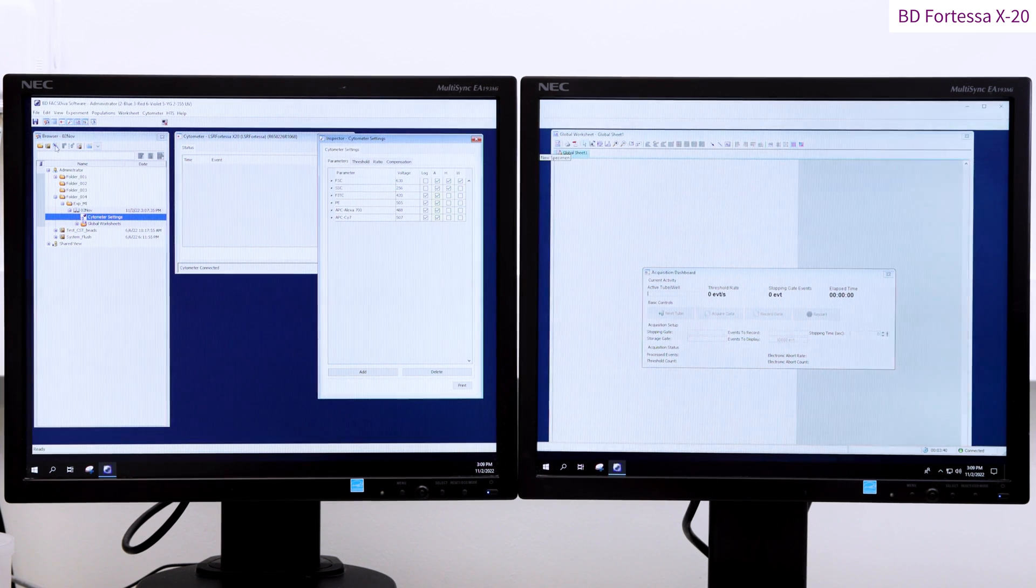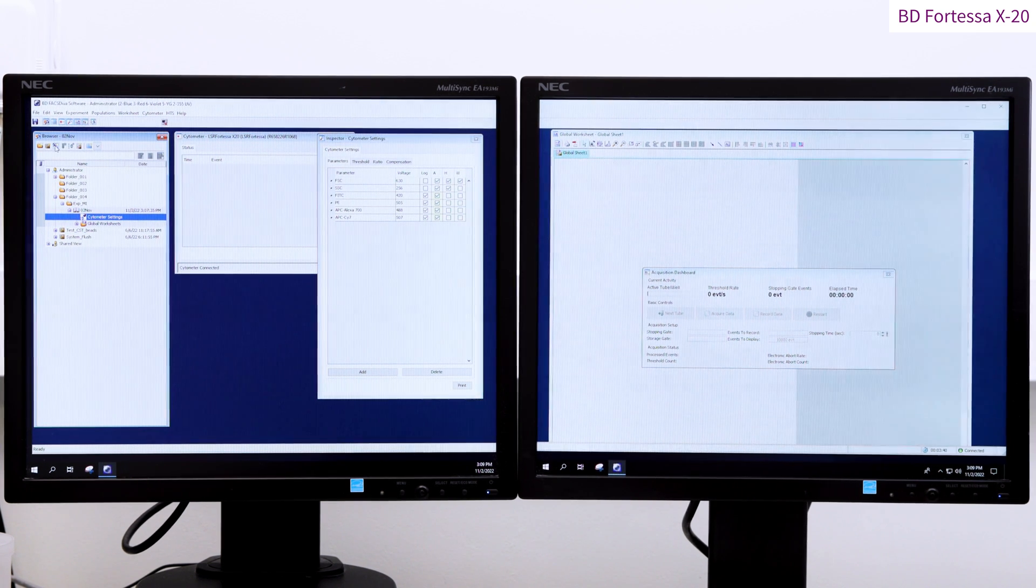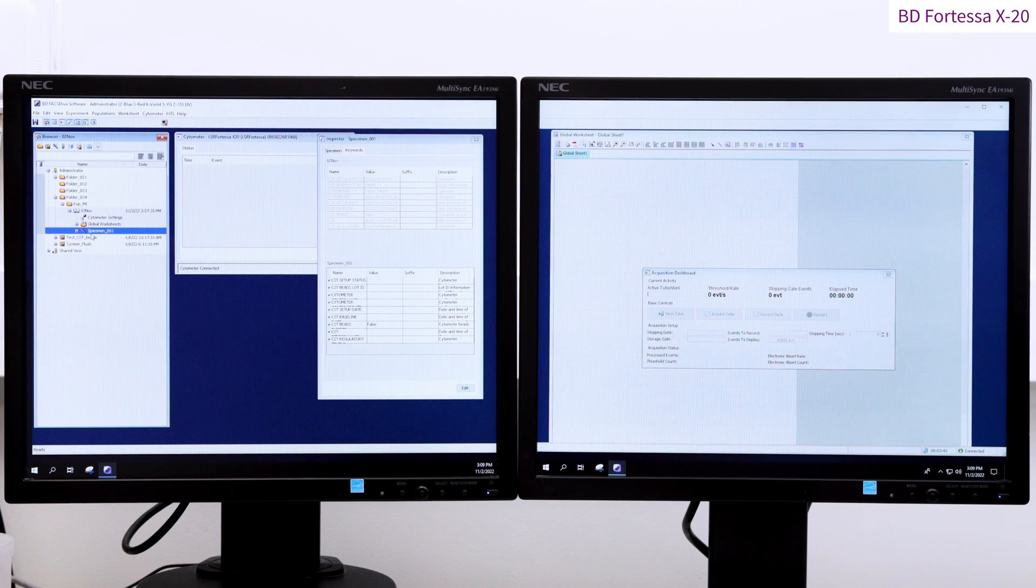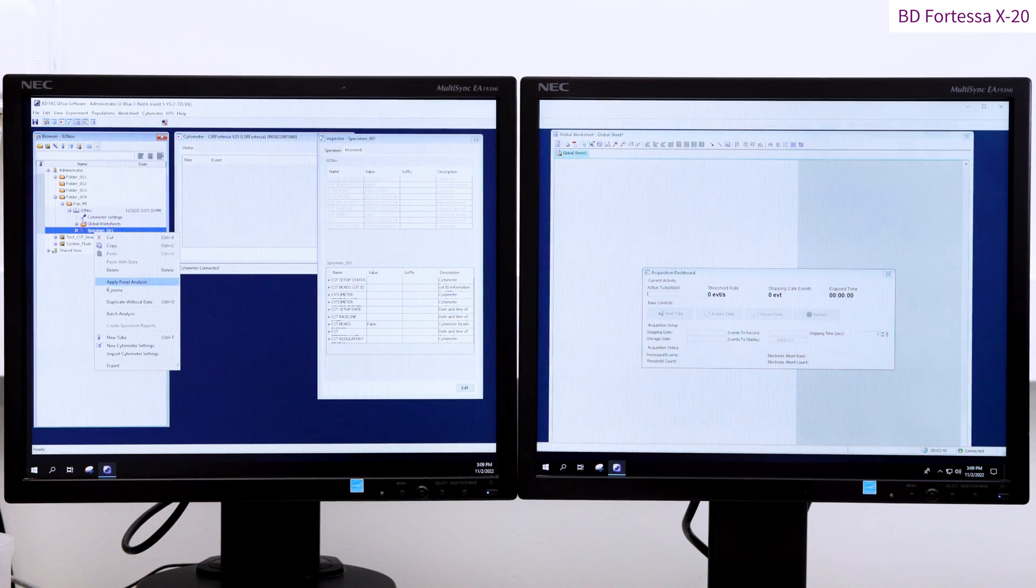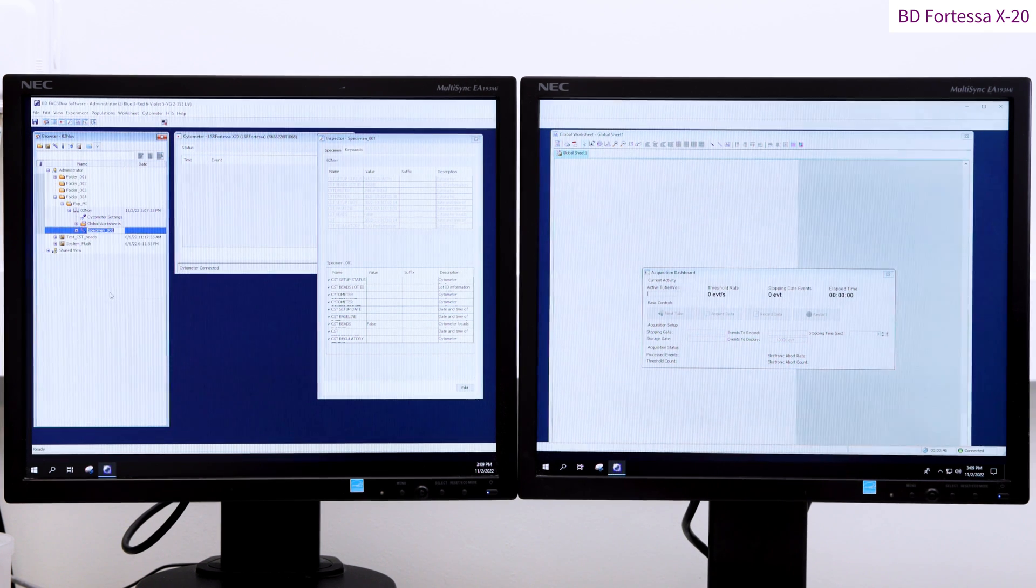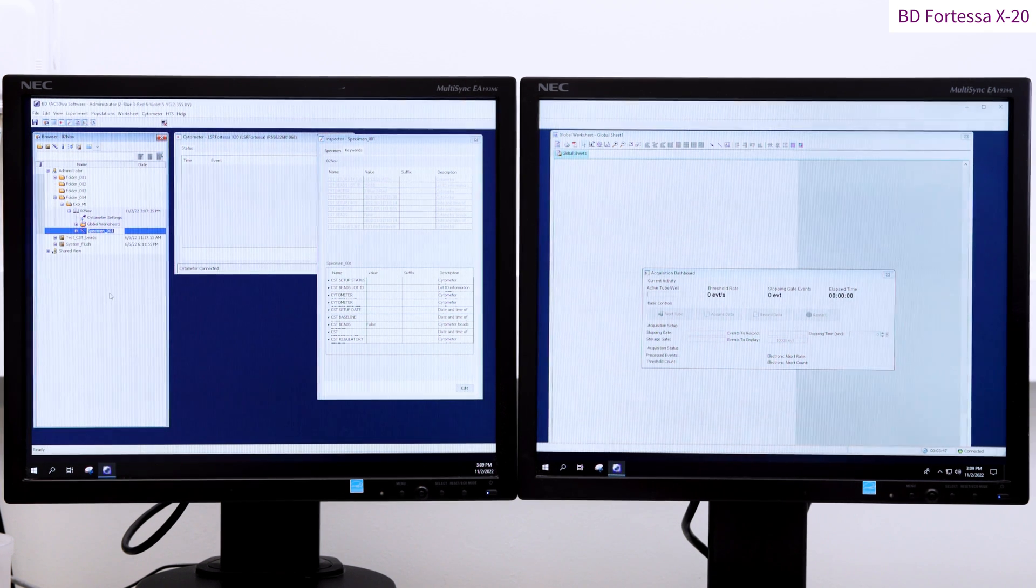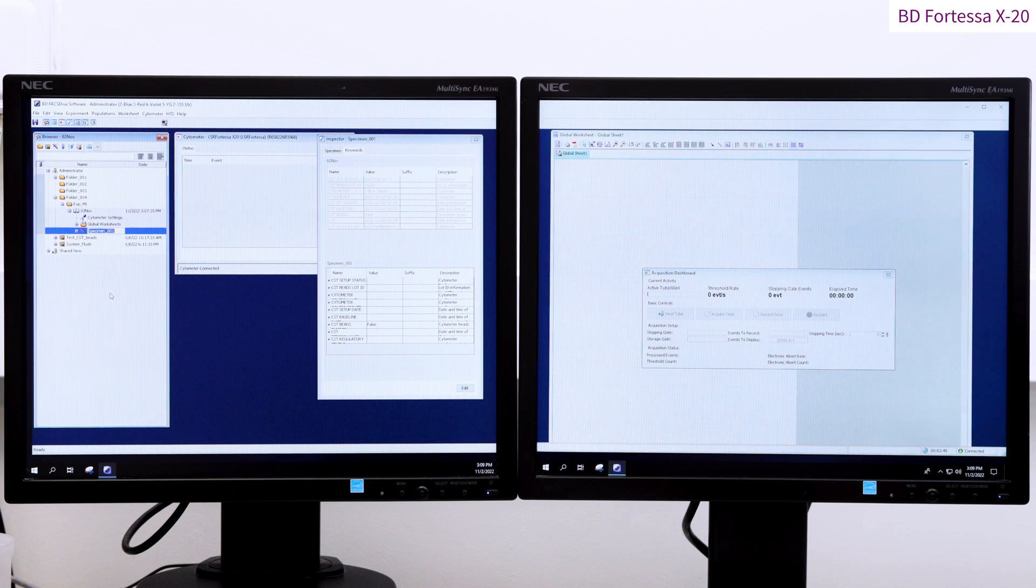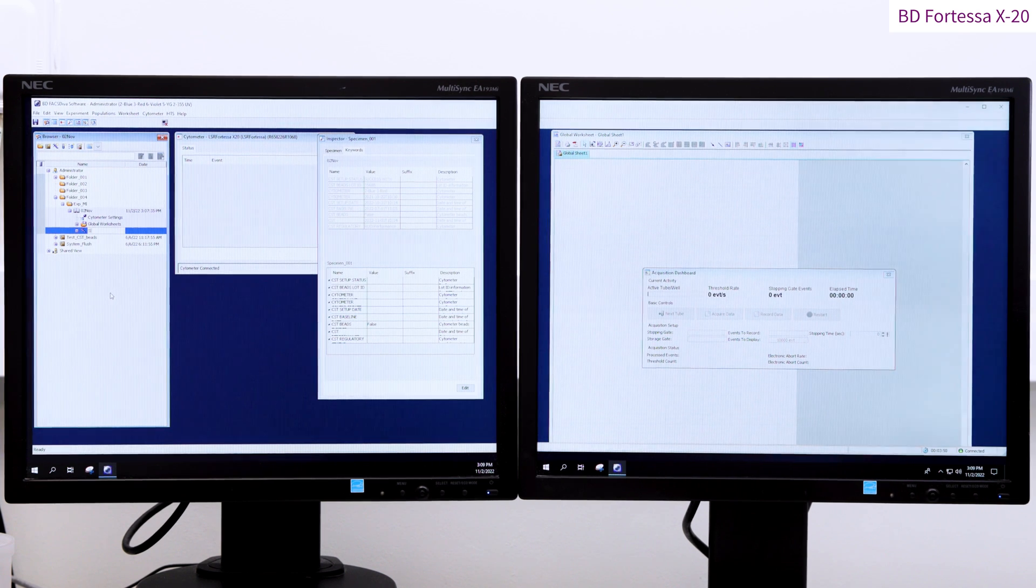Add a specimen to your experiment as follows. This specimen can be renamed via a right-click. Today we're working on a mouse tissue called Spleen.